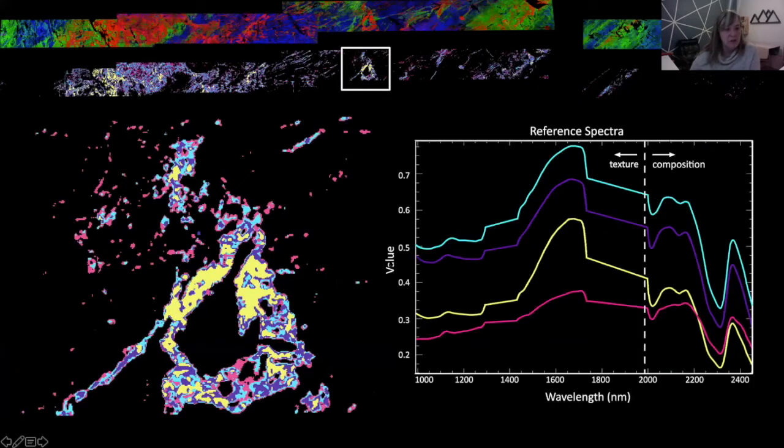And in this image here, where we have the very repetitive fill of the pore lining, pore filling, and then secondary and third pore filling phases. Now, if we take a look at the reference spectra, we again can look at the compositional side and the textural side. In the compositional side, it's difficult to tell from this picture, but I think you can probably see it.